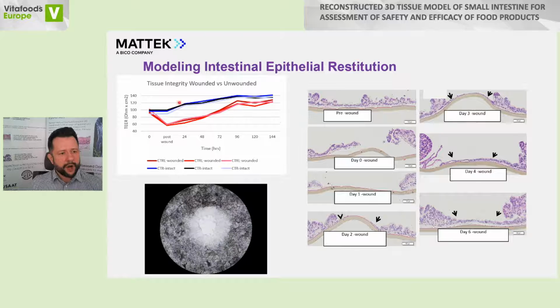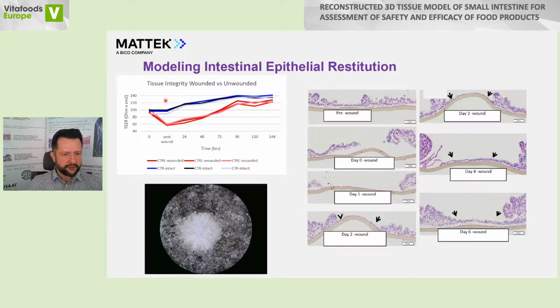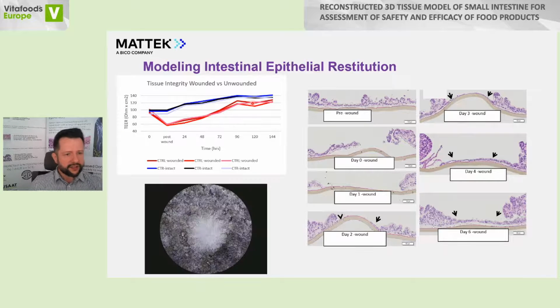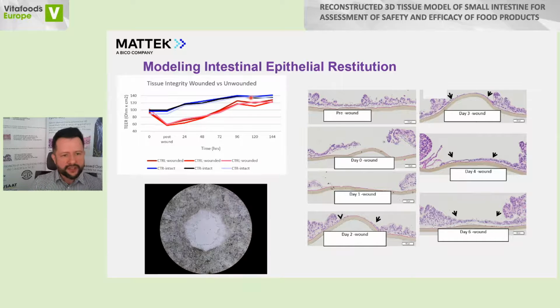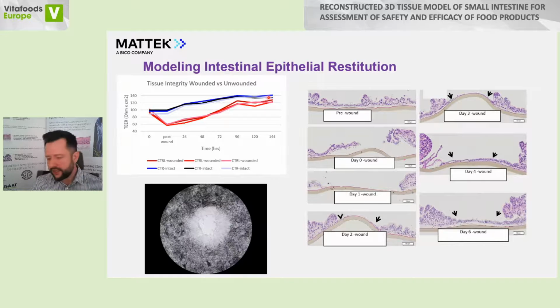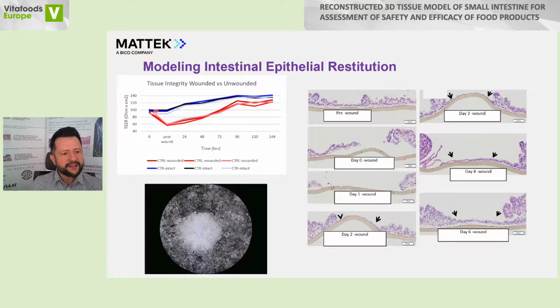You can also monitor this using the TEER. Here you can see the comparison of 3 different tissues in bluish colors. You can see the normal tissue with the TEER maintained at roughly the same values or slightly increasing. I showed you before that the TEER is pretty stable, but here the slight increase was caused by the treatment, which was also used in this case.